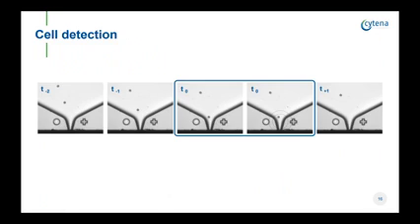For each cell that is dispensed, a series of images is stored to the hard drive of the instrument that document how the cell was isolated. Let me now show you another video that illustrates how the software looks like.